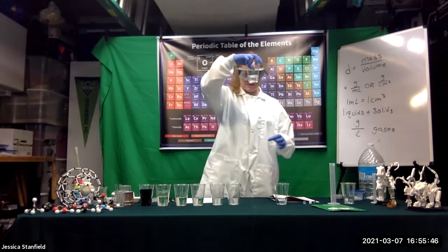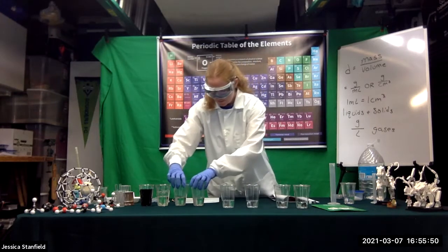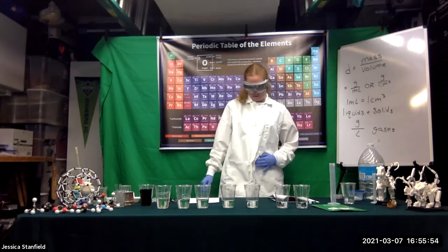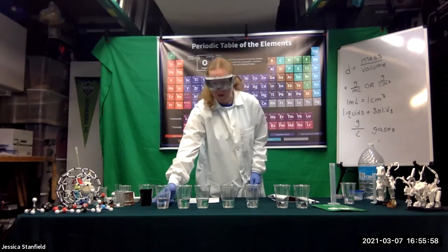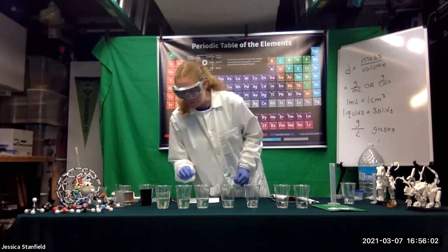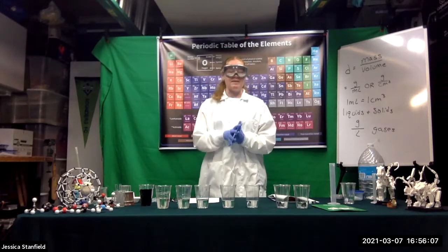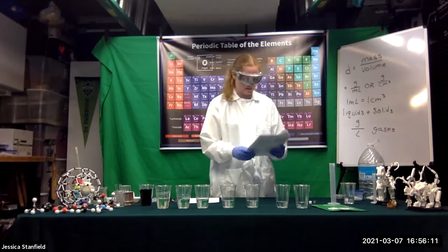All right. It's just about dissolved. I'll let that sit for now. I'm going to move all this stuff out of the way. And you'll notice, I don't know if it's very visible on the video, but as we get to the more concentrated solutions, it is a little yellowish looking, but it is dissolved because you can see through it. If it is not all dissolved, it will definitely be a very cloudy solution, but it's okay if it's slightly yellow as long as it's clear.